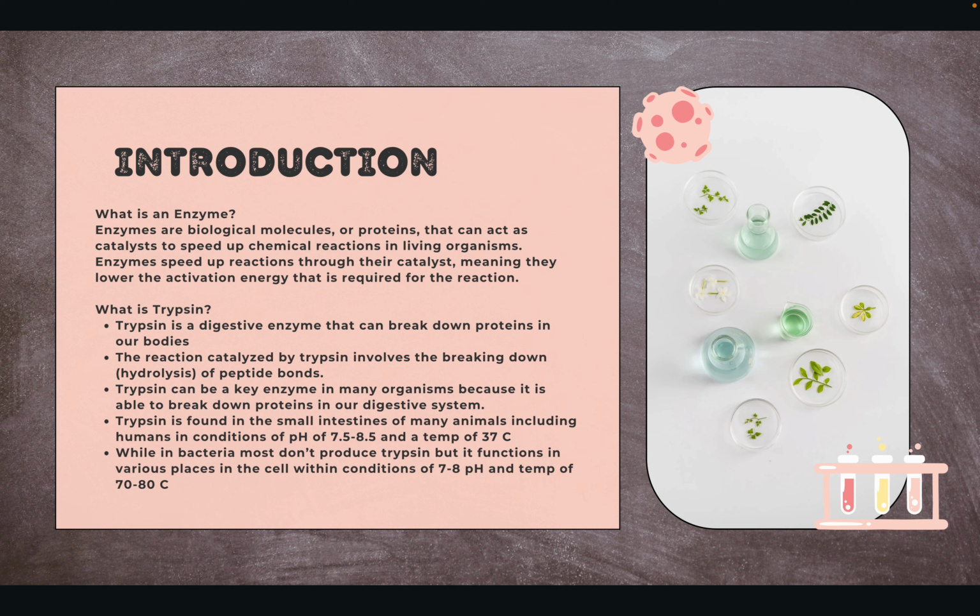Trypsin is our specific enzyme that we're using for the experiment. It is a digestive enzyme that breaks down proteins in our bodies. The reaction catalyzed by trypsin involves breaking down peptide bonds within proteins through the process of hydrolysis.